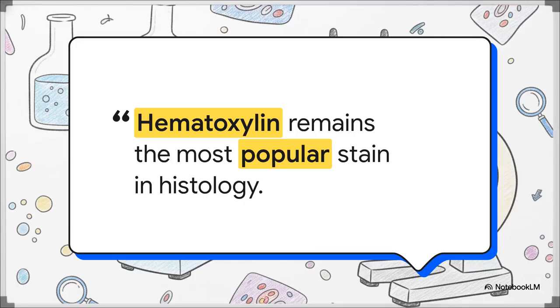You know, if you just put human tissue under a microscope, it's actually completely transparent. It's literally like looking at a clear pane of glass. But with the right chemical key, each stain reveals a hidden story inside that tissue. Suddenly, we can uncover specific microorganisms, connective tissue fibers, and abnormal protein deposits that are otherwise impossible to detect.